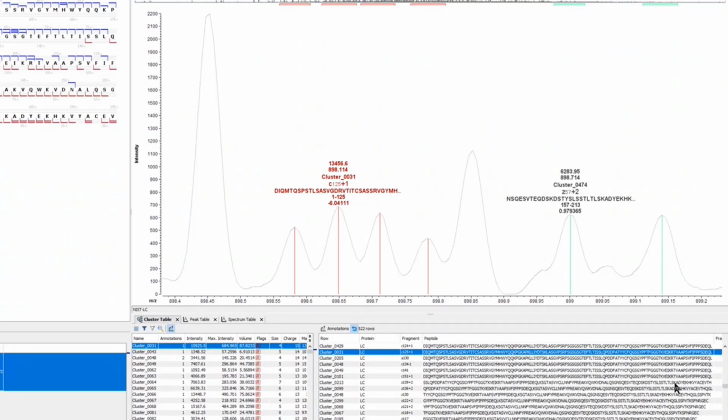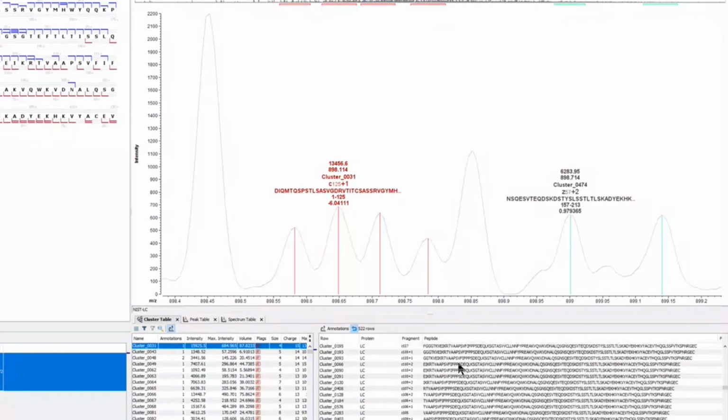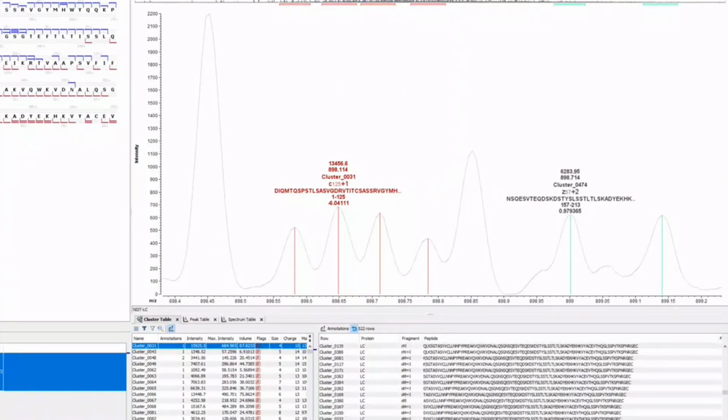And so if you look over to the right-hand side, you'll see that the C-terminal side looks the same. I don't quite have my row wide enough, but you see these like C, E, G. That's what you're seeing on the far right side, and then these peptides will start to get smaller and smaller and smaller.